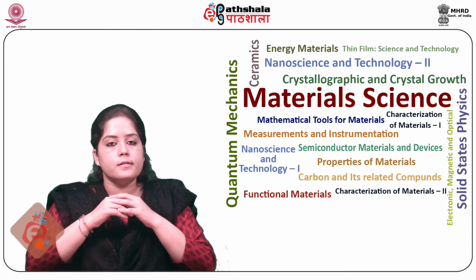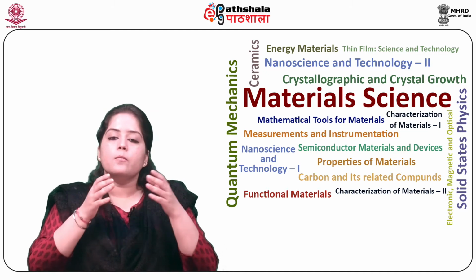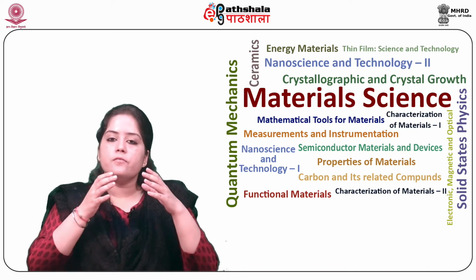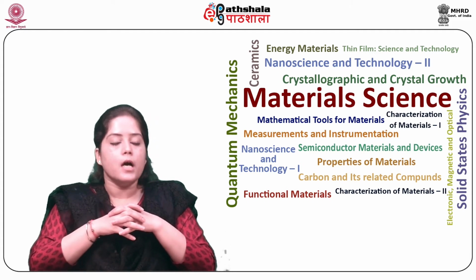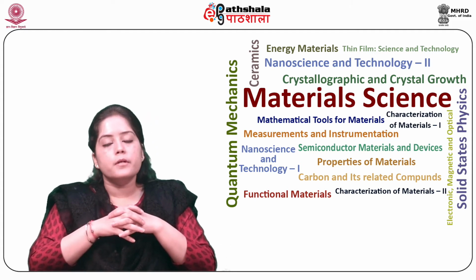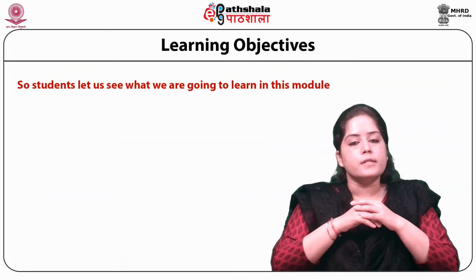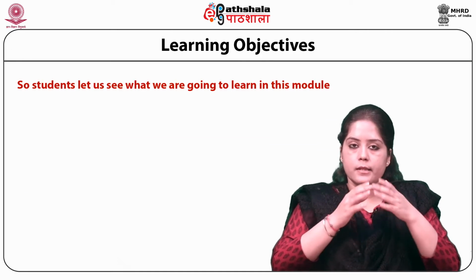So students, today we are going to discuss the module Optical Characterizations Part 1, Fourier Transform Infrared Spectroscopy, FTIR, from the paper Thin Film Science and Technology. So students, let us see what we are going to learn in this module.